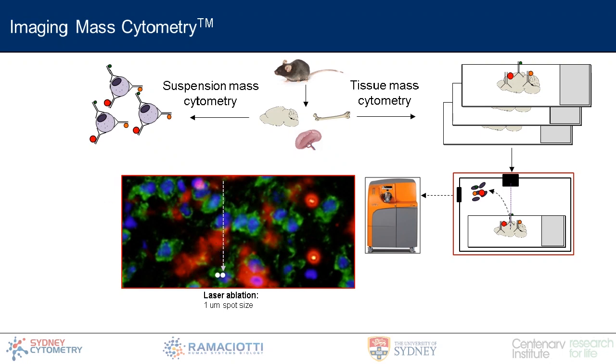Material from there will go into the CyTOF. Then we can ablate the next spot and the next spot. And we can basically do this until we have rastered the entire area of tissue that we want to image. And all of this happens automatically, so this is all very hands-off. We don't need to touch it ourselves, which is very helpful.